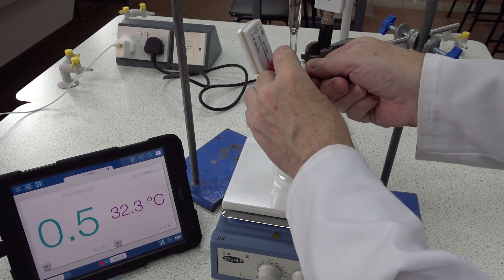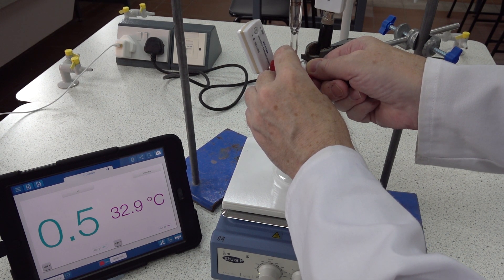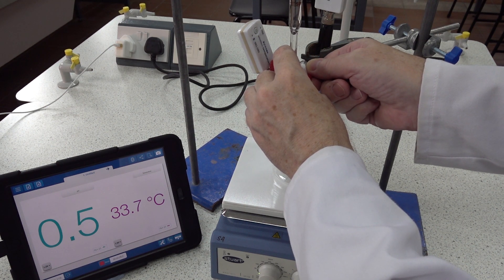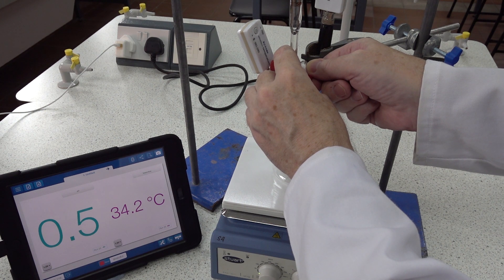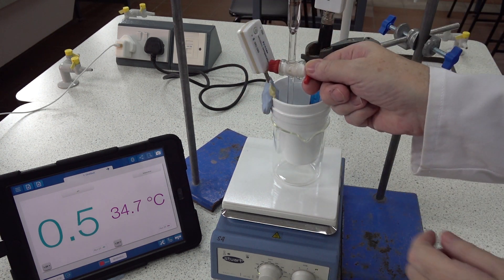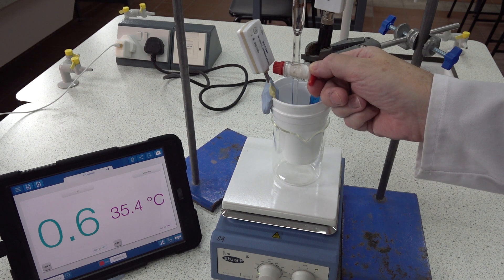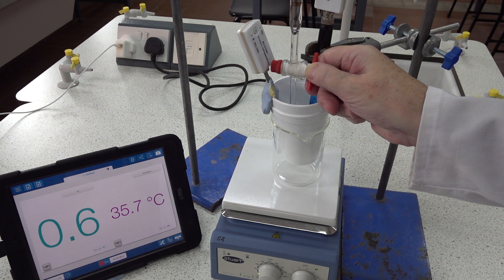Eleven centimeters cubed. Twelve. Thirteen. Fourteen. Fifteen. Sixteen. Seventeen. Eighteen. Nineteen. Twenty centimeters cubed.